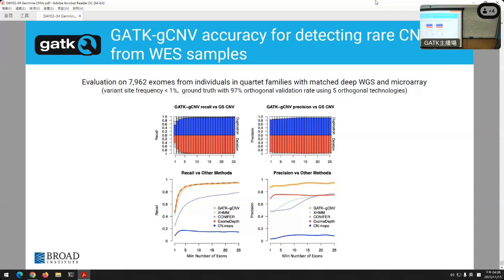My second question is, for example, my reference genome is a non-human draft genome, and is the copy number variant state of the draft genome important for GCNV to identify the copy number states in all the samples when I use the reference sample to map it? Okay. Let me address your first question first, except that I forgot it. Can you repeat that? The recommended sample size and the coverage depth of the sequencing reads.